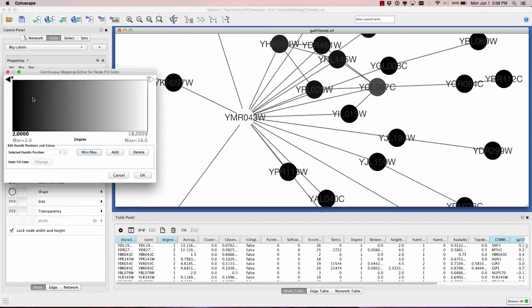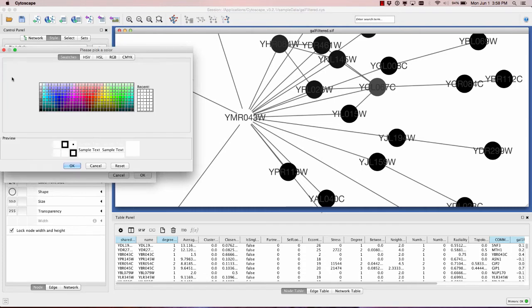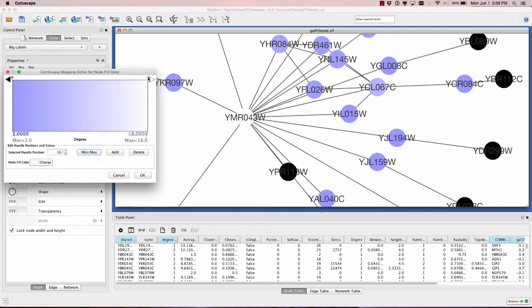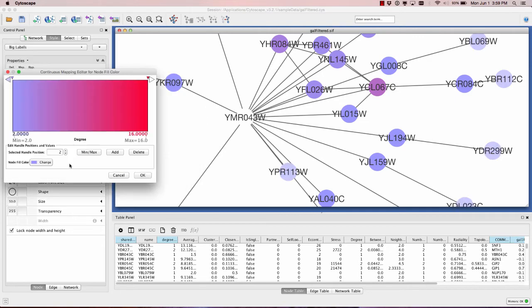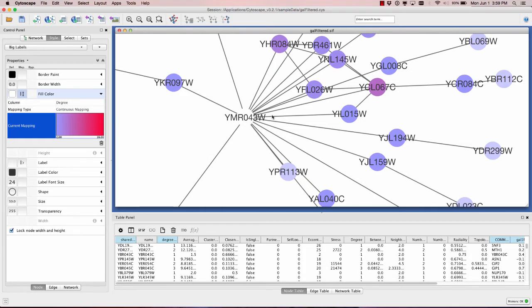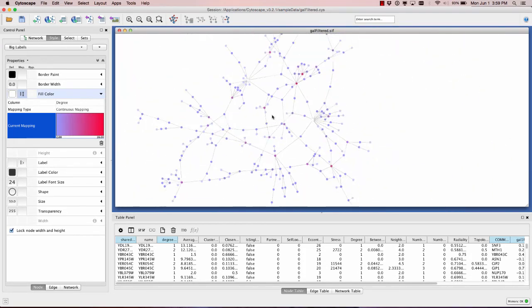I'm going to double-click to change these colors - I'll select light blue for low degree and red for high degree. Now the more connected a node is, the more red it is. I can zoom out and see what the most highly connected nodes are - they'll be red. This is how to use Cytoscape to take data from your spreadsheet associated with nodes and visualize it. I took the degree column and mapped it to color. I can click on the column headings to sort them, just like in Excel.